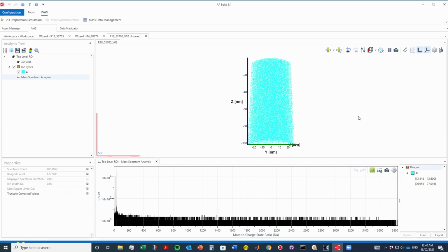So you've got the detector XY, the voltage, the standing voltage pulse, the number of pulses between the evaporation events, and so on and so forth. So it's good to have access to that information to do a whole bunch of different types of analyses. And one of the ones that it's good for is if you want to play around with other reconstruction procedures, because it saves the detector X and Y.